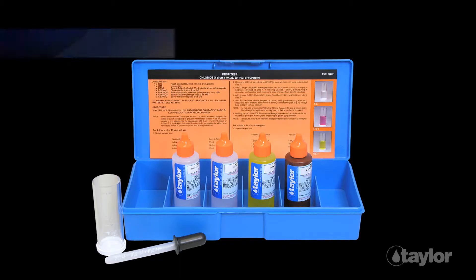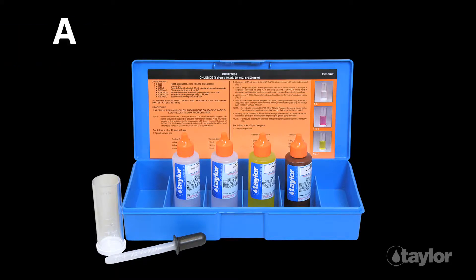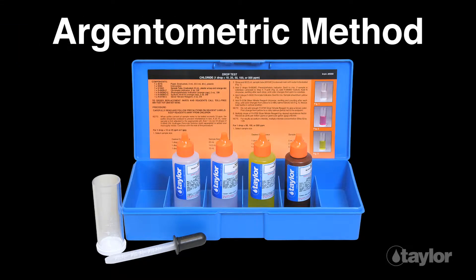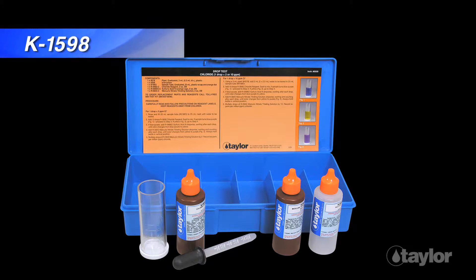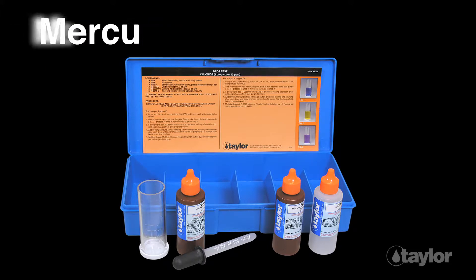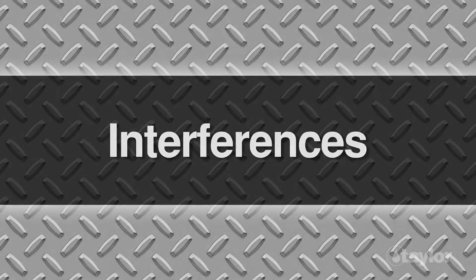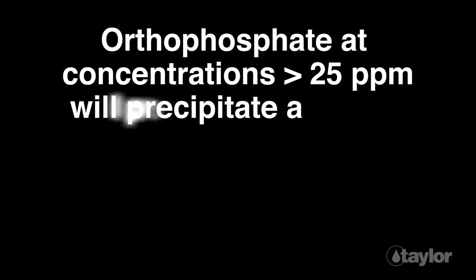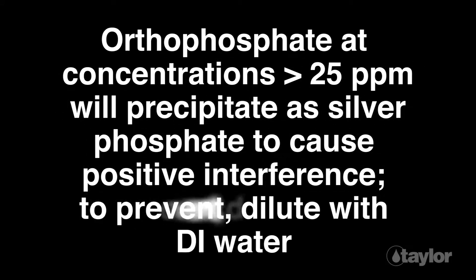Taylor's K1549, which we are demonstrating in this video, is a simple drop test that employs the argentimetric method to quickly and accurately determine chloride levels. The mercuric nitrate method featuring our K1598 is demonstrated in a separate video on our website. Orthophosphate at concentrations greater than 25 ppm will precipitate as silver phosphate to cause positive interference.